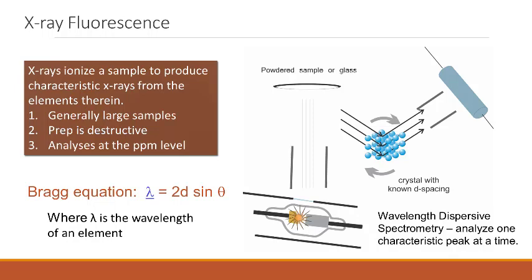To get away from the messiness, we can work in the higher energy part of the spectrum, X-rays. The trade-off is that we need more specialized conditions to pull this off. I want to start with the general process of X-ray fluorescence and actually introduce a machine that is designed to look at the fluorescence generated by a sample. So this machine is diagrammed on the right in a cartoonish fashion. You need an X-ray tube.